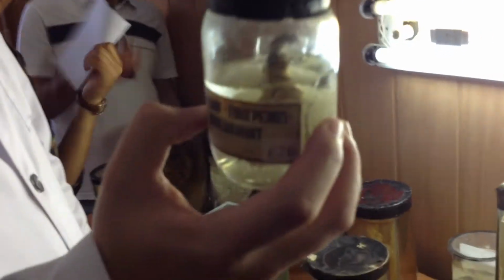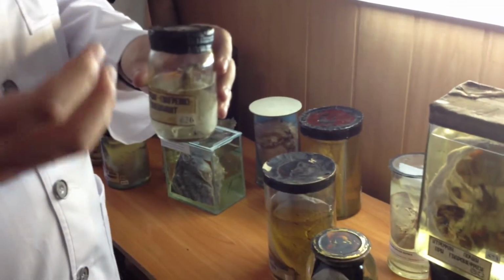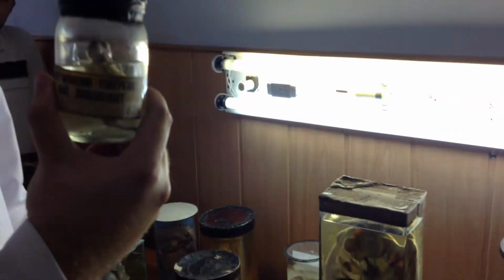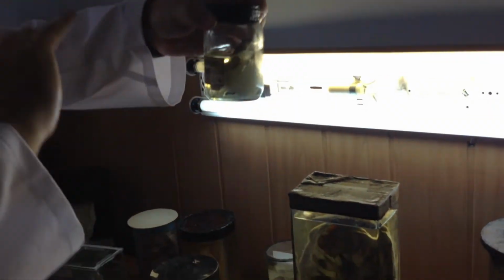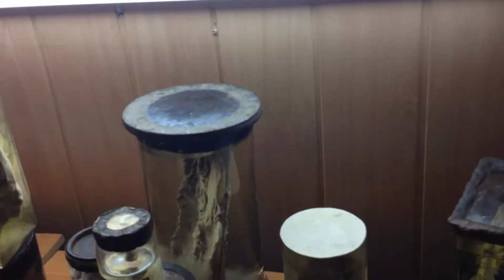Phlegmonous appendicitis. But actually, the type of appendicitis may be also established only during microscopic investigation. So you can just say that the specimen is presented with an appendix which has some deposits of membranes on the external surface. It has irregular shape and so on. So we're just describing what you actually see.